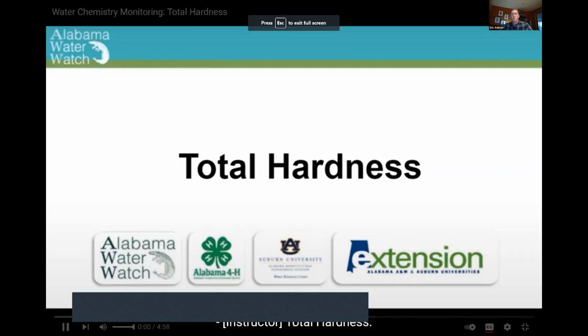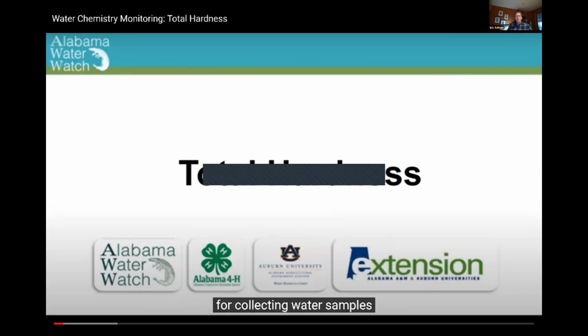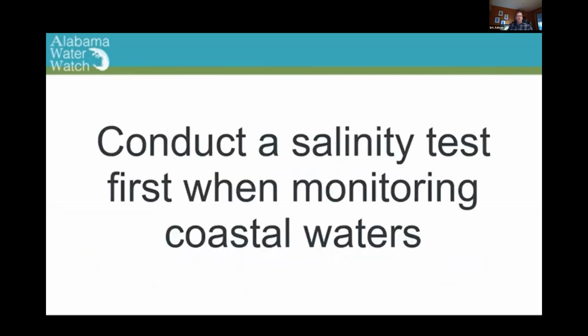Total hardness. This video will show the proper method for collecting water samples and conducting a test to determine the total hardness of a water sample. When monitoring in coastal waters, conduct a salinity test first. If salinity is detected, do not perform the hardness test.